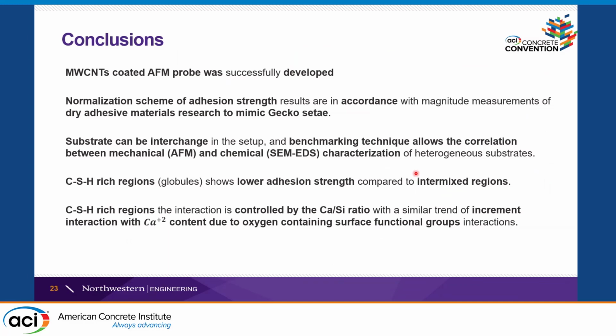So the main conclusion of this research was that we developed this multi-wall carbon nanotube coated AFM probe that you can use on different substrates, so you only have to change the substrate to get adhesion between different substrates.